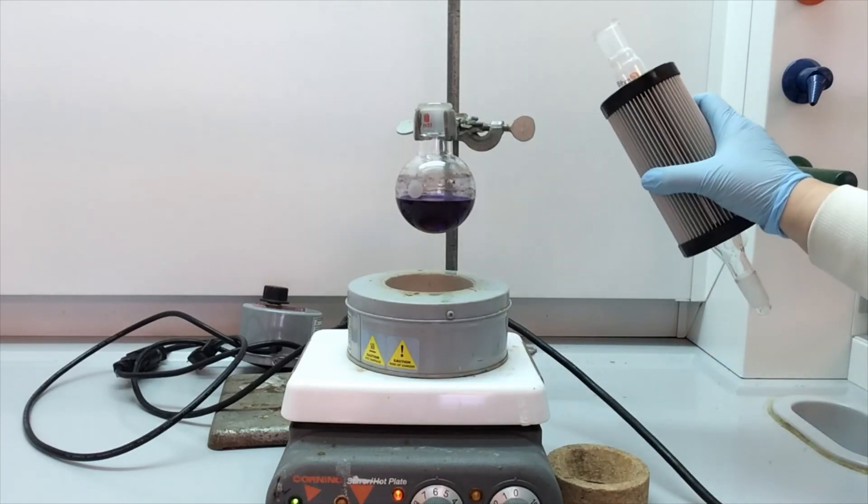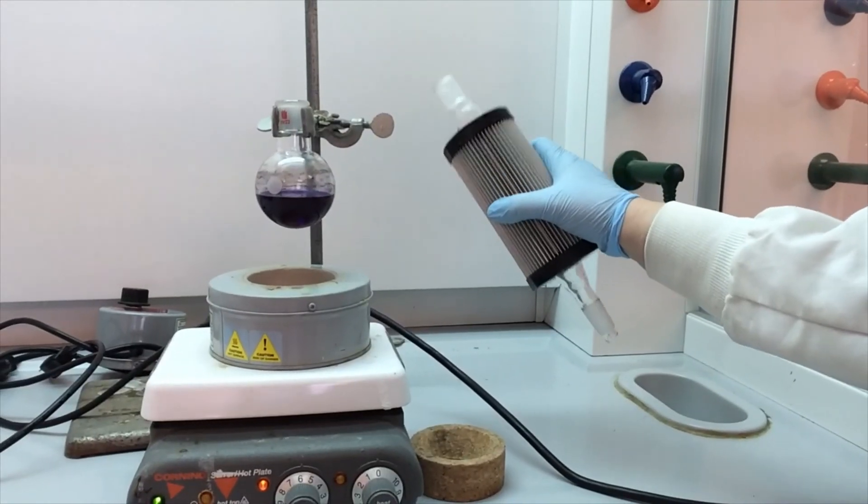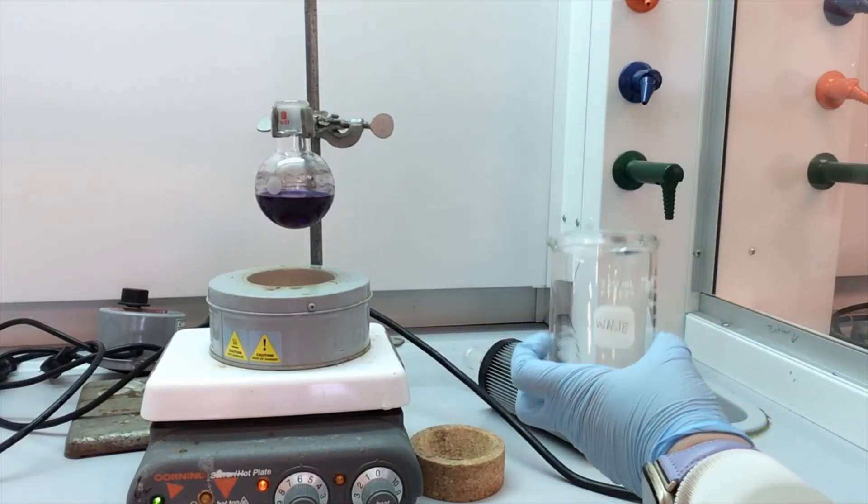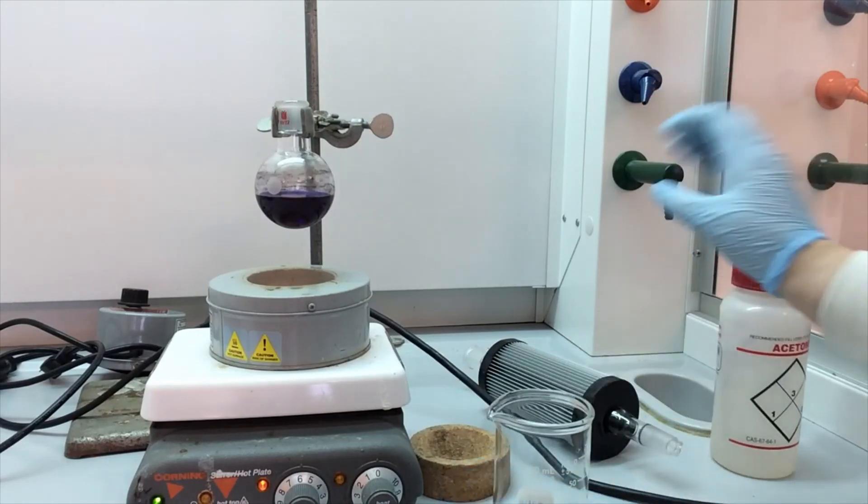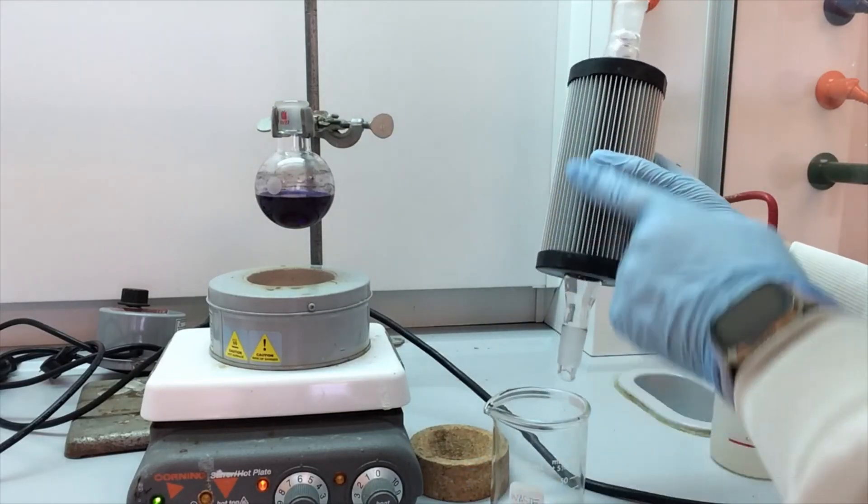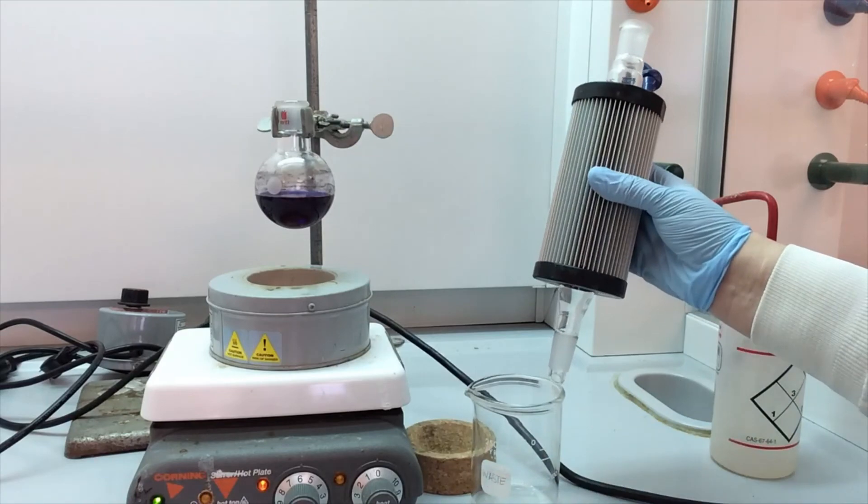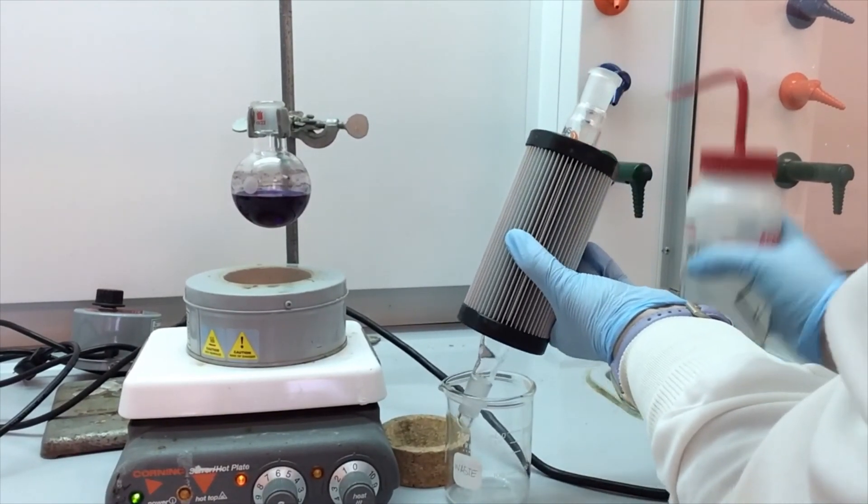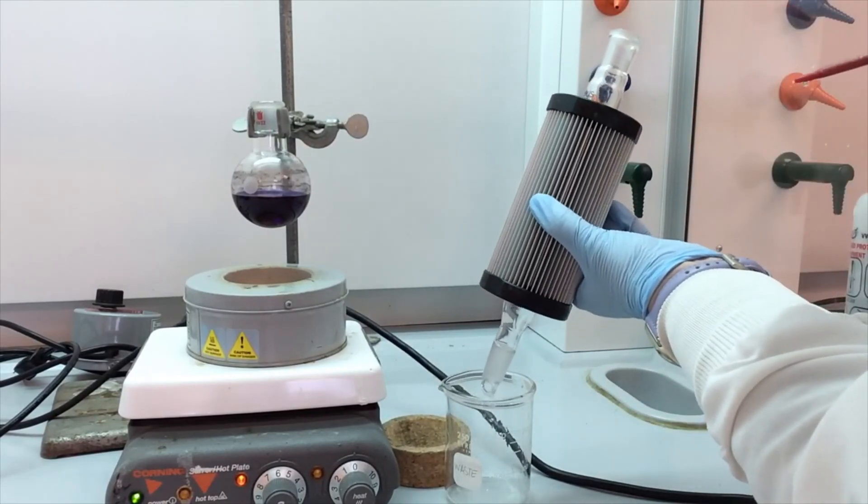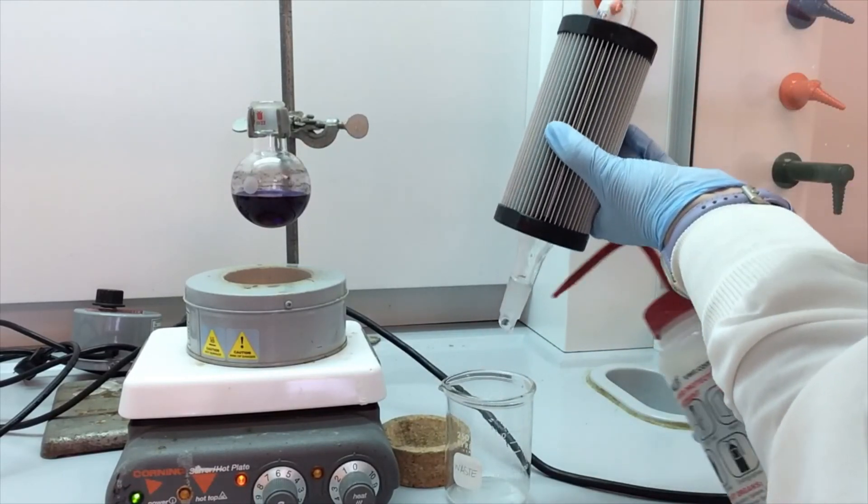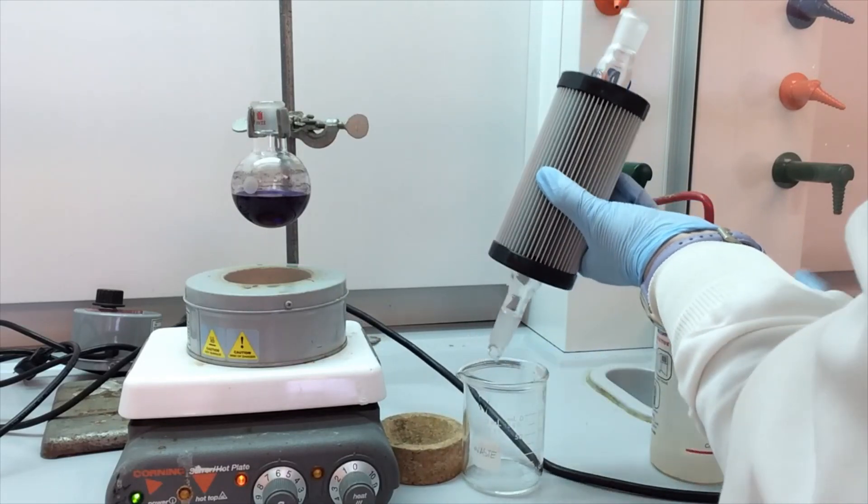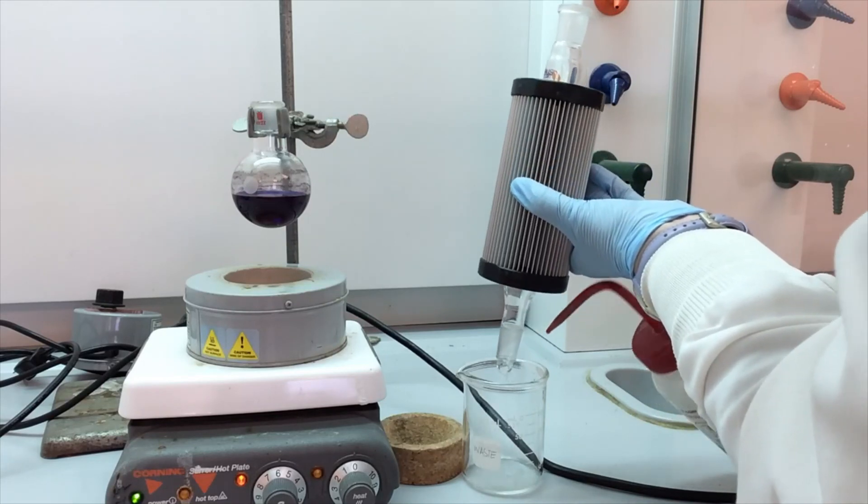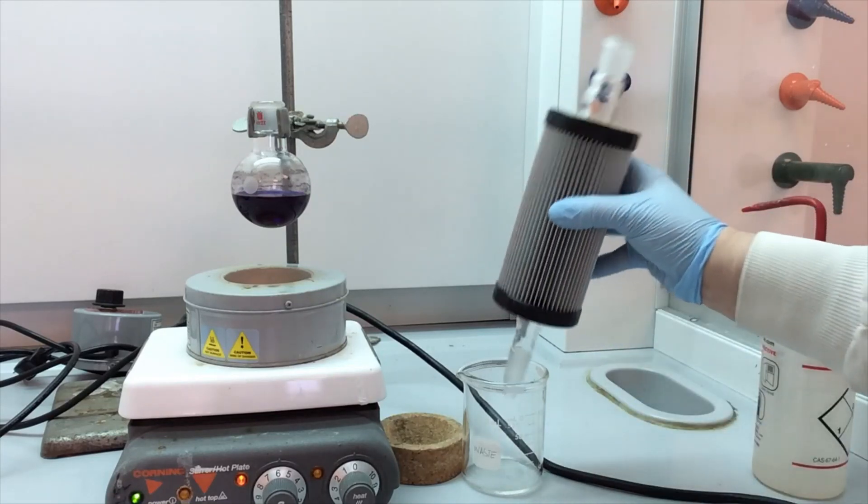So I have a waste beaker, and I also have my acetone squeeze bottle. And so there was only solvent in this, so it's not particularly dirty. So the only thing that I'm going to do to clean this is squirt some acetone inside, let it drip into my beaker. And then I'm going to squirt the ground glass joint and make sure that's clean as well. And that's it.